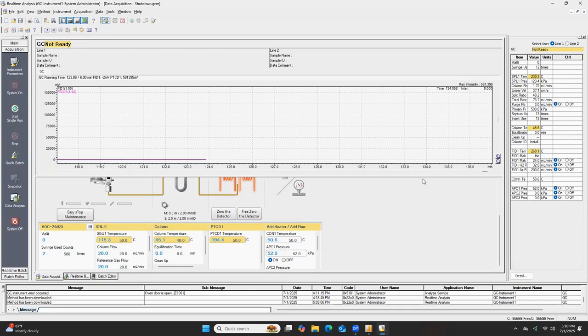Yes, because you want to manually turn off the flame for the FID. Actually, I'll let you navigate the front panel. So hit the home button at the very top. Okay. So now we are looking at line two. Well, let's look at the FID. So the FID was line... Hang on. Okay, then I'll click the button.